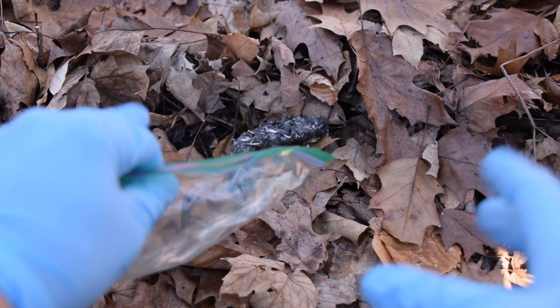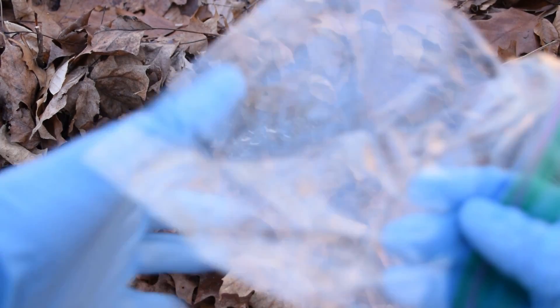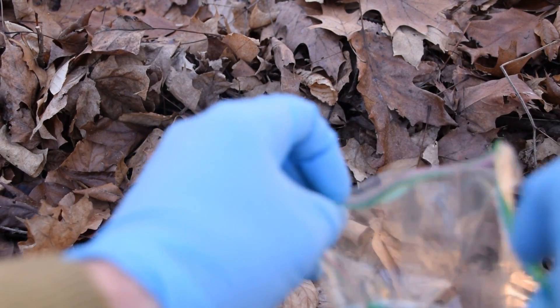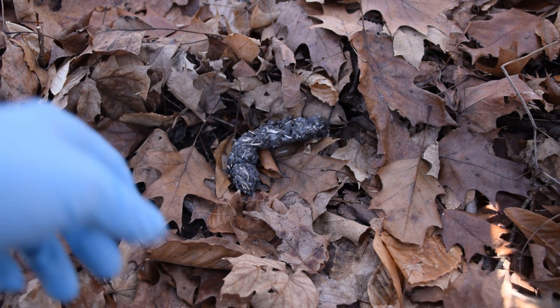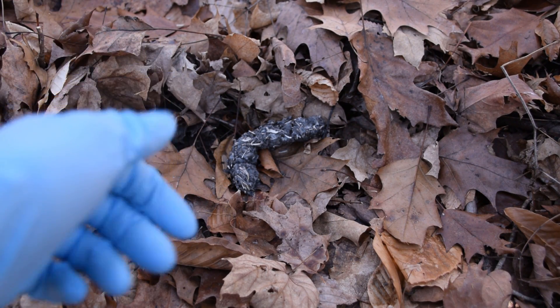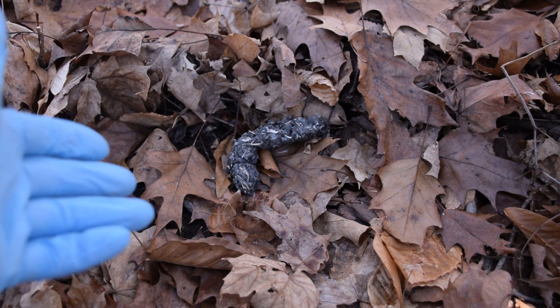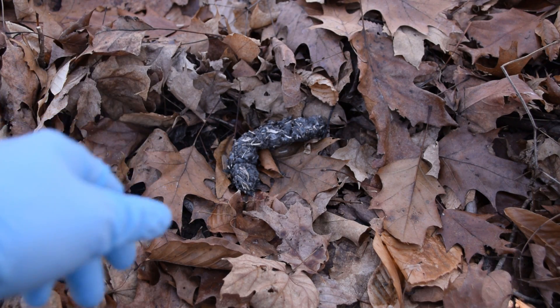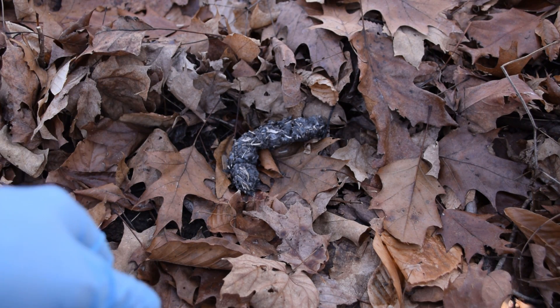I've got my gloves on now and I have a Ziploc bag so we can gather this up safely and not get our hands dirty. There might possibly be some bacteria in here — it's a pretty good chance considering it is owl puke. I don't really like to touch puke from a human, let alone an animal, so I've got my gloves on to keep my hands nice and clean.